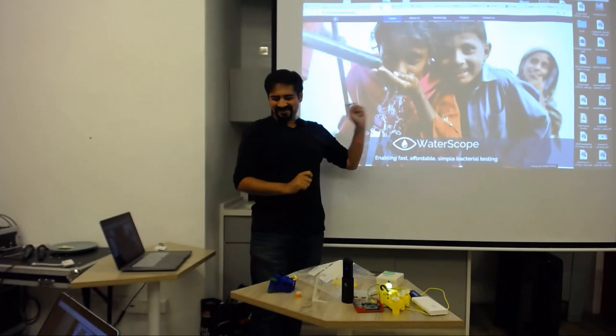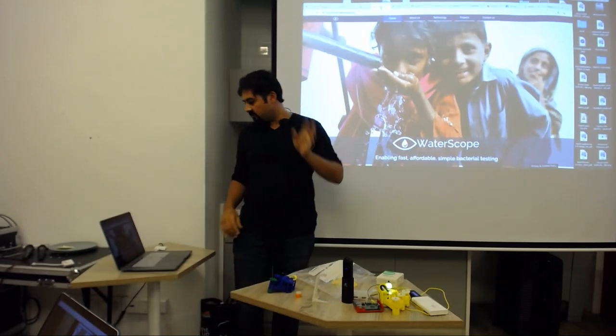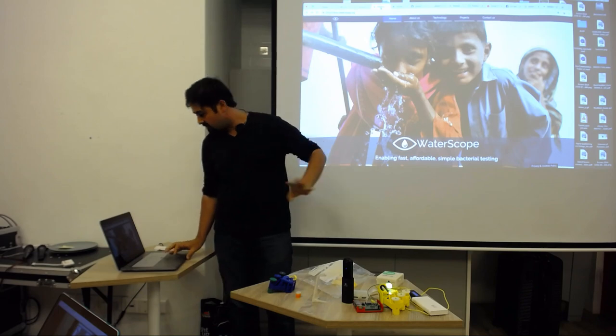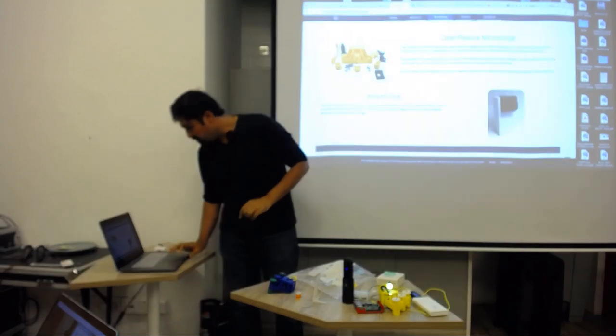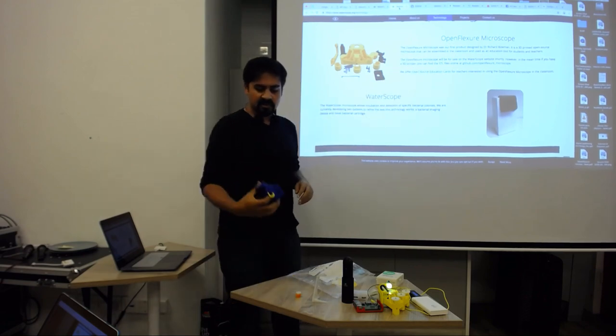So Waterscope is a company that's trying to make these kits, and they're making money out of it. That's the business model. Don't ask me about business. I know nothing. So they're two different things. Open Flexure is what the project was called.